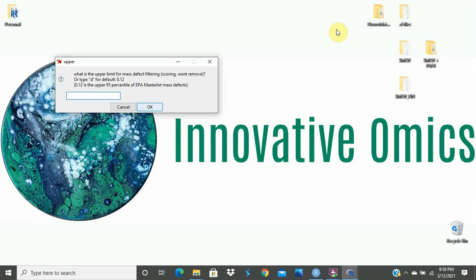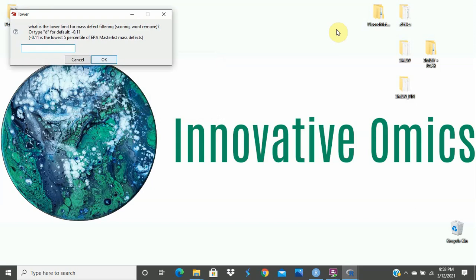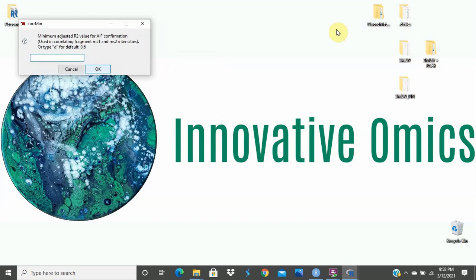A mass defect is based on a molecule's exact mass and the number of types of non-carbon atoms. An upper and lower mass defect is used for increasing confidence in annotations which fall under an expected mass defect when fluorines are present in the molecular formula. Our default parameters are based on mass defects found in the EPA's PFAS structural database, and we will use the default values for the upper limit and for the lower limit as well.